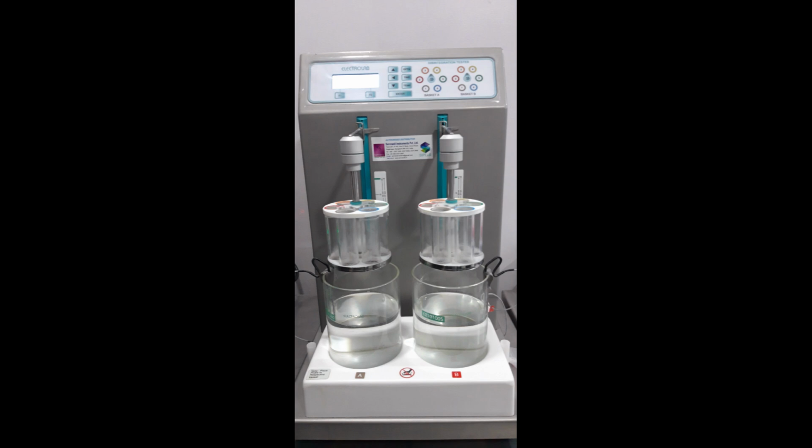Regulatory compliance and stability: pharmacopoeial acceptance, mandatory test under USP 701, EP 2.9.1, IP 2.5.1. Accelerated stability: monitoring disintegration changes under high temperature and humidity. Here are the must-watch factors when setting up or running a disintegration tester.